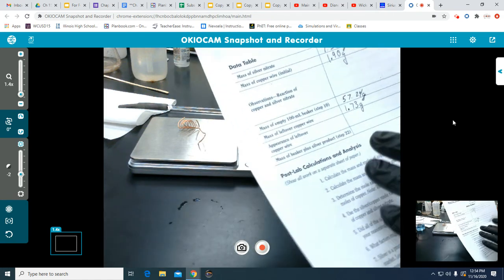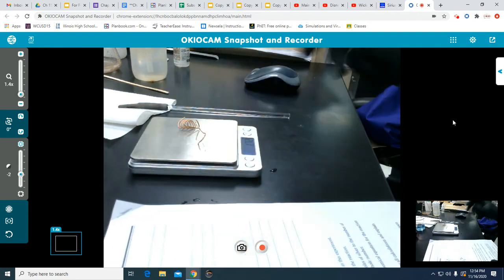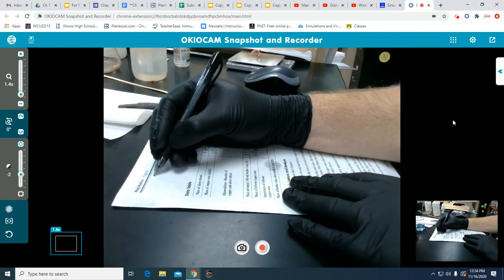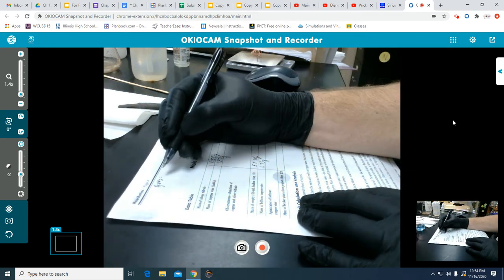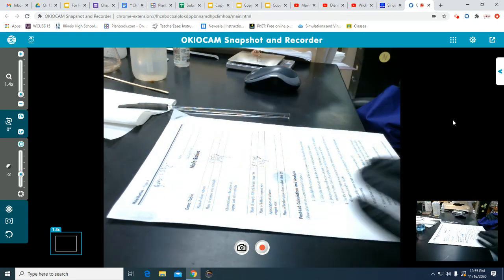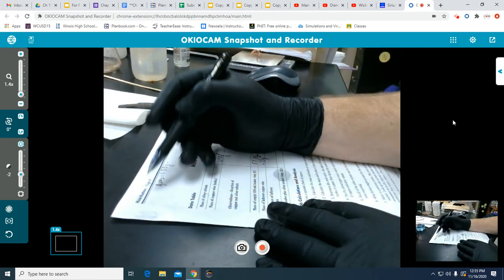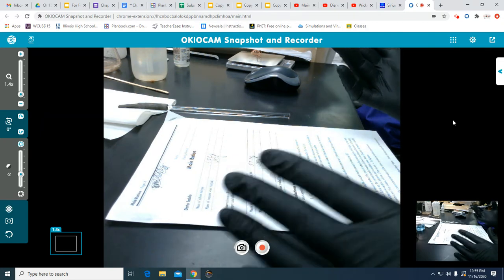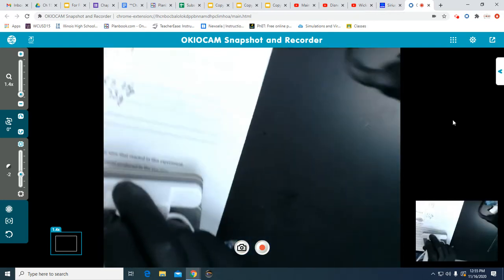So I'm going to help you out here. If we look at nitrate, AgNO3, silver nitrate, we start off with 1.50 grams. We don't have to worry about how much silver was produced until tomorrow when we weigh it here.